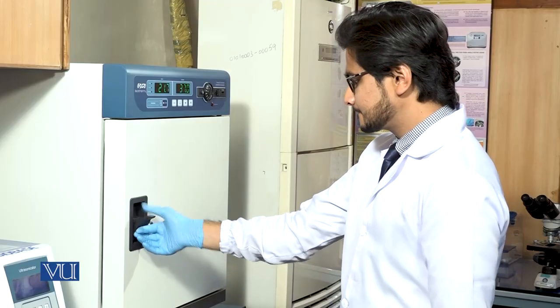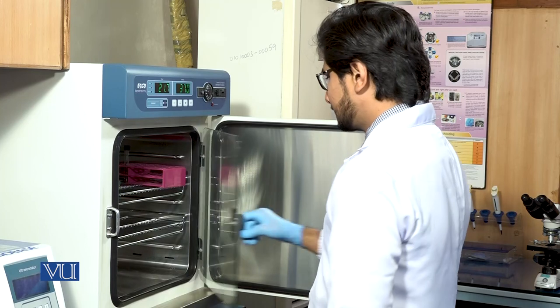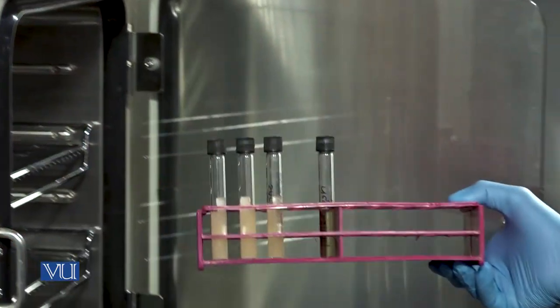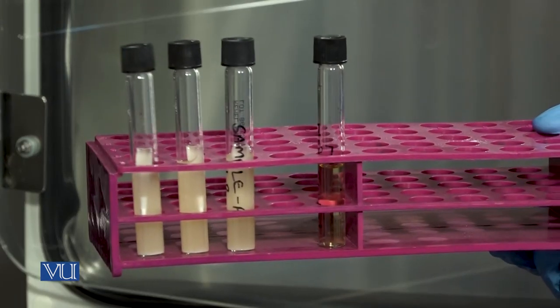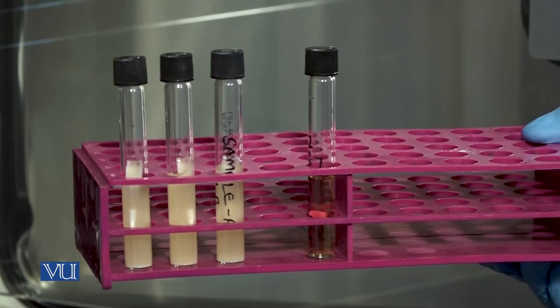After 12 to 24 hours, check for bacterial growth. Tubes with white haze in the liquid medium show positive growth, and tubes with clear media show no growth as compared with the negative control.